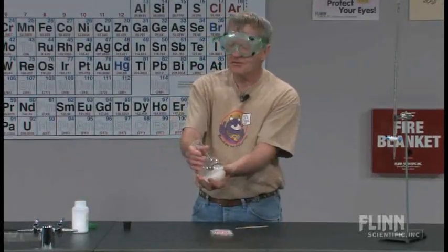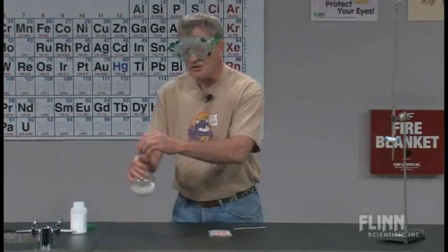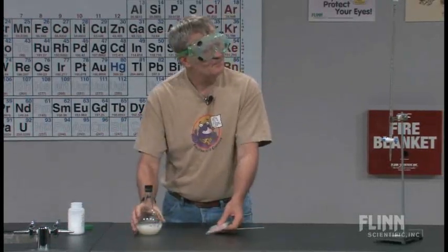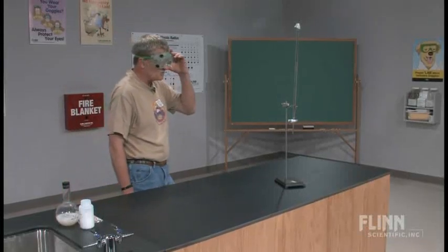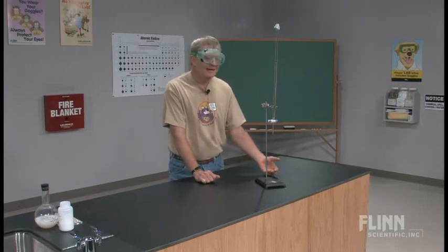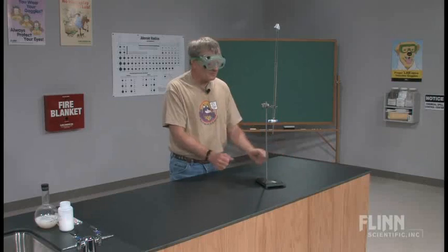That in itself is really kind of neat. Here's something a little different — the same situation, another example of a sodium acetate supersaturated solution. You could use this in earth science to demonstrate the formation of stalactites and stalagmites. In this case it would be a stalagmite because we're going to see it grow from the bottom up. In a lot of ways it is the same process — it is a precipitation of a crystal out of solution. Sodium acetate supersaturated solution is inside the burette, and I'm going to open the stopcock.